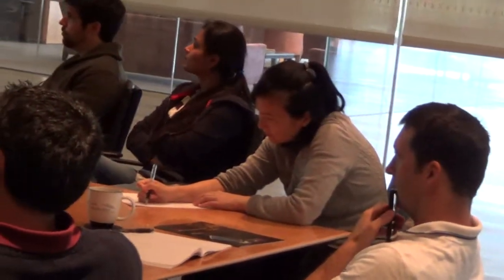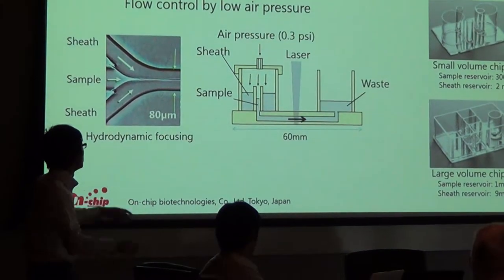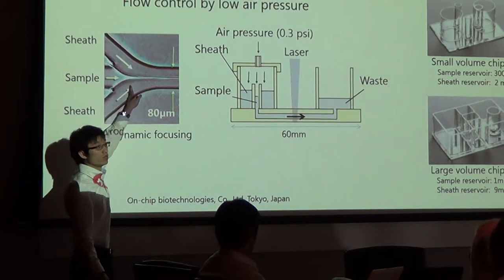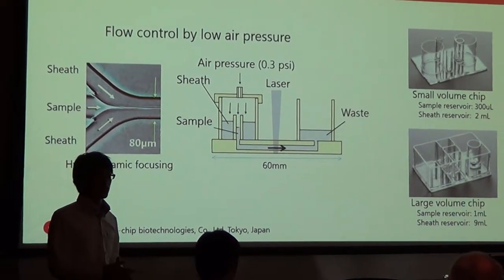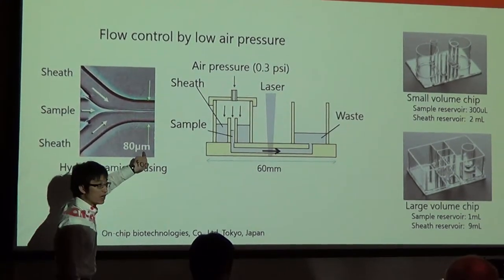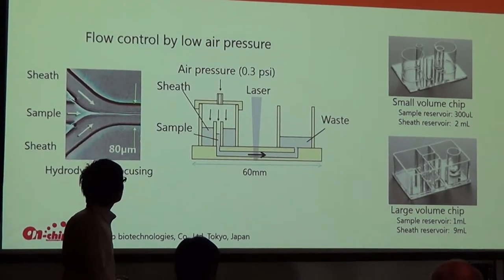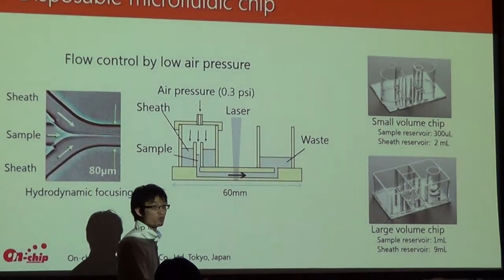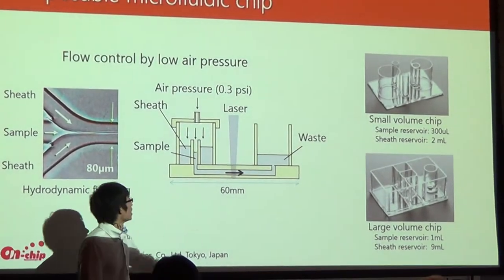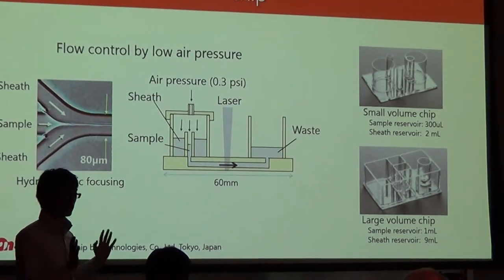So how we do the sorting within the chip is that, as you can see, these are the microfluidic channels, and we have three channels combined at the intersection here. Using this sheath fluid, we squeeze the sample fluid into a narrow flow, which is kind of similar to a conventional flow cytometer anyway. We have a channel of 80 micrometers, and the sample flow would be less than 10 micrometers in width. We have a chip with reservoirs, and we simply apply air pressure rather than mechanical pressure to drive the flow. Because we have air pressure applied to it, we have no actual direct contact with the solution that you're using. So that eliminates the whole process.